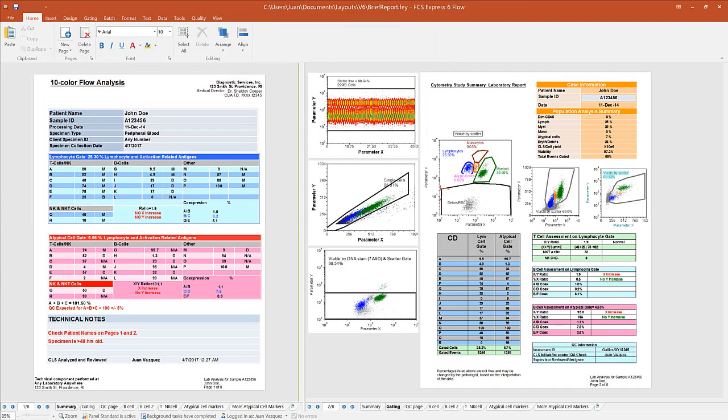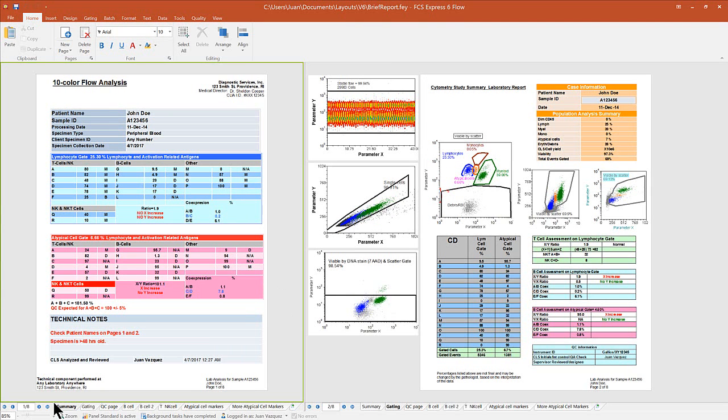So I think the first thing we can talk about is the ability to create reports using FCS Express. Typically in many clinical labs, chances are you're probably using a pretty basic software. You collect a set of tubes for a patient, and the software that you're using is somewhat limited in how it could take that data and produce actual results for you, summarize it, give you the actual results that you need to help interpret that case, and sum it up together in a concise package.